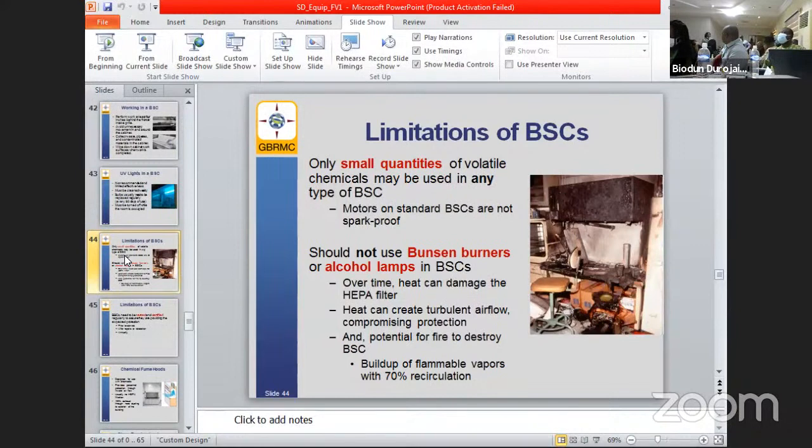You see, that's a form of substitution. No mitigation measure. We talk about the elimination and substitution. So they are substituting for a lesser evil. You know, these are causes that are interwoven. They are interlinked. During the mitigation, we talked about the hierarchy, the mitigation strategies. And the very first one is elimination and substitution.